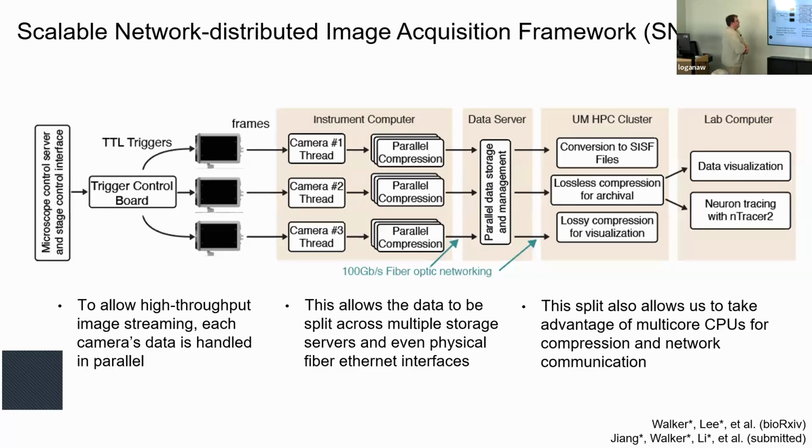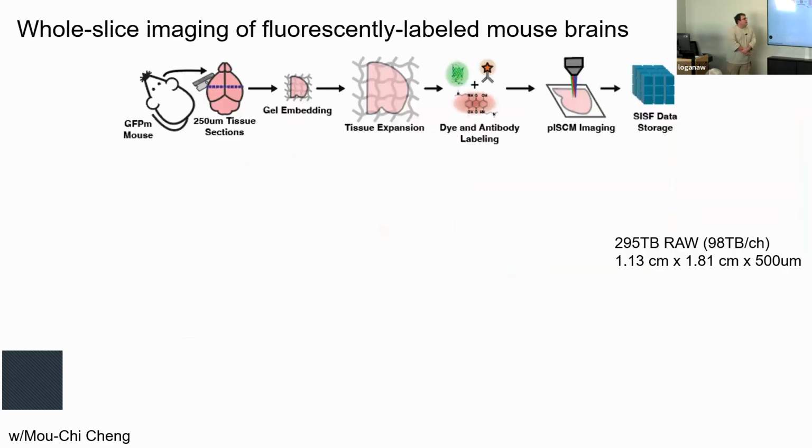The key thing here is that through this pipeline, we can essentially run the microscope at full duty cycle for hours and days at a time. Our longest experiment has been like 4 days, I think. So it allows us to collect hundreds of terabytes of data in a single imaging session, which to our knowledge is not something that anyone else has been able to do without basically having many imaging computers all imaging at once.